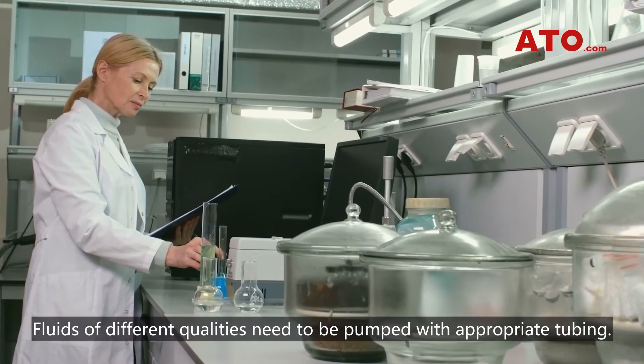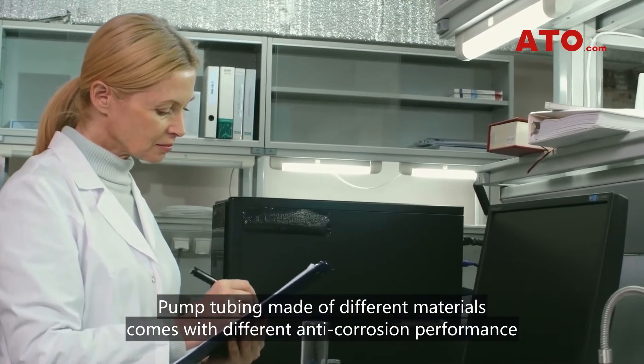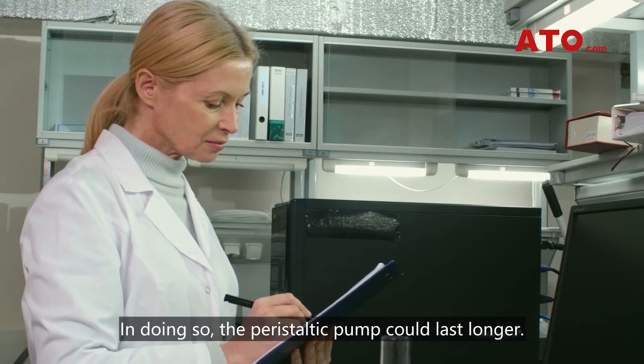Fluids of different qualities need to be pumped with appropriate tubing. Pump tubing made of different materials comes with different anti-corrosion performance, so you need to choose the right tubing based on the specific medium you intend to pump. In doing so, the peristaltic pump could last longer.